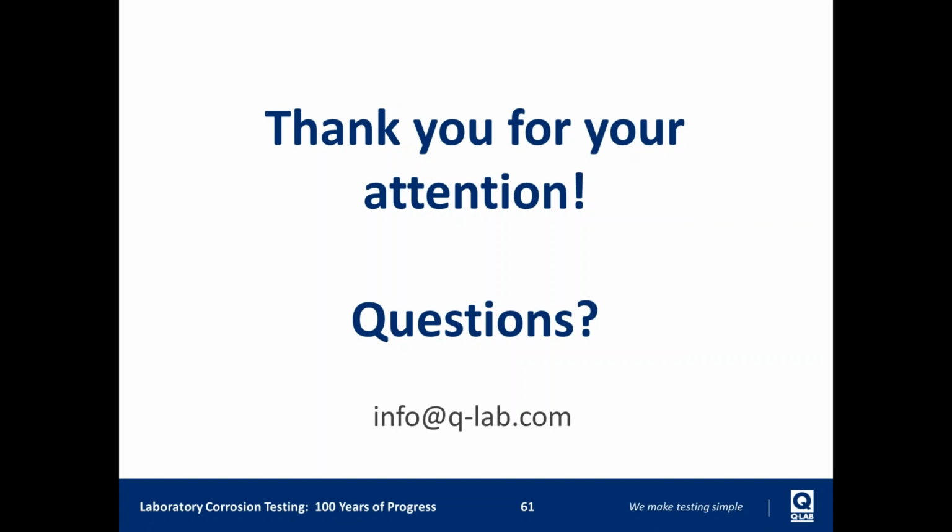If you're getting low mass loss, you can increase the on time. And if you're getting high mass loss, you can increase the off time. We've found that that's a pretty good chance of meeting that. We've also found that, with our default settings for our tester, we can set it once, and assuming that you don't get any clogs, there should be no problem over the duration of the test. You should be in range.